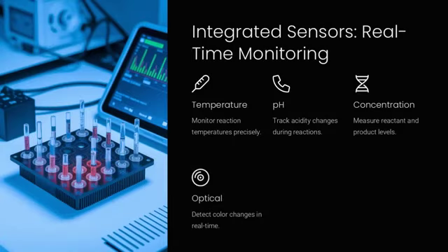Pressure-driven flow uses a controlled pressure gradient to move fluids through microchannels. For example, a syringe pump delivers precise nanoliter volumes of reagents to reaction sites on a chip, much like squeezing a tube of toothpaste produces a steady, predictable stream.